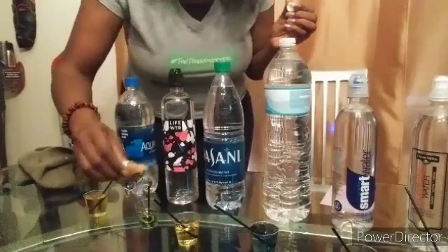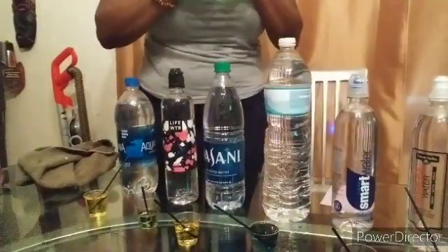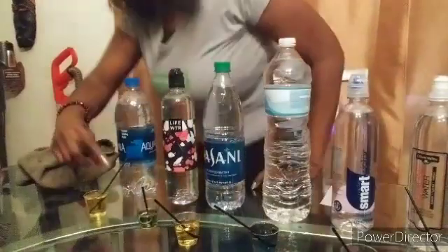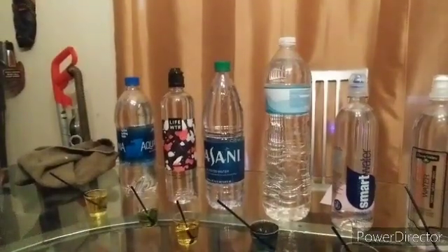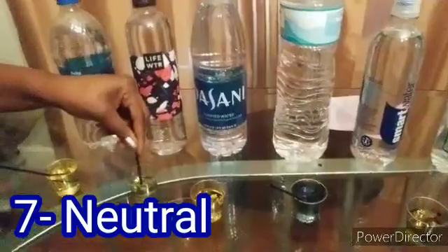I'm going to give them all one more drop just to enhance the color: one, one, one, one - we know that one is good - one, one, one, one. I am not surprised because I actually like New York tap water; I think it's good as long as it's cold, guys - it's blue! I'll go around the camera and show you each one again. I'm coming around to the other side of the camera just so you guys can see.